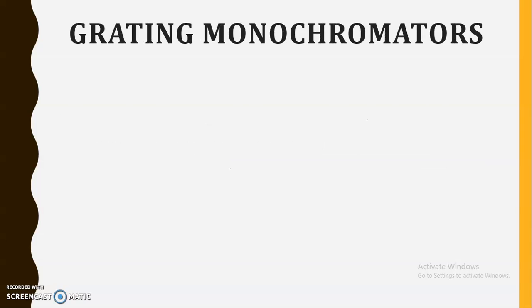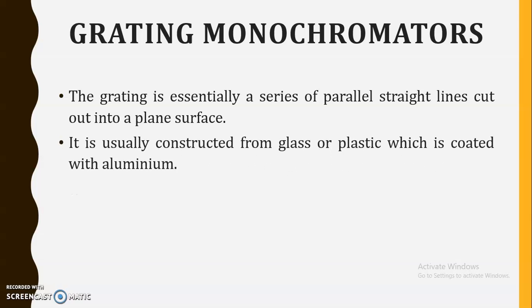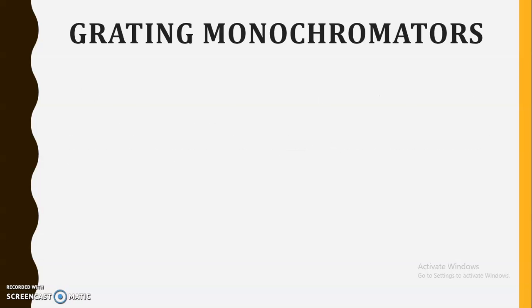Next, we will discuss the grating monochromators. As I said, grating monochromators are widely used nowadays in different IR spectrophotometers because of their high sensitivity as compared to the prism monochromators. Gratings mean what? Generally, triangle shapes are engraved on a plane surface in a very small range. Gratings are essentially a series of parallel straight lines cut out on the plane surface so that if we take a transverse section, it will show a triangular surface. It is usually constructed from glass or plastic which is coated with aluminum.